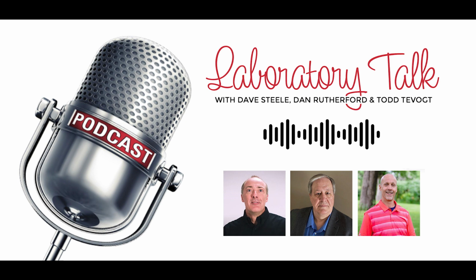For our first few podcasts, we've decided to go back to basics, back to the very basics, in fact. Way back. Today, we're going to spend some time talking about the basic principles of the technical uses of vacuum, what vacuum is, how it's measured, and how it can be displayed in different ways. We're going to talk about some of the differences between measuring pressure in absolute and relative terms, and talk a little more about some of the various units of measurement that are used to express very low pressures.